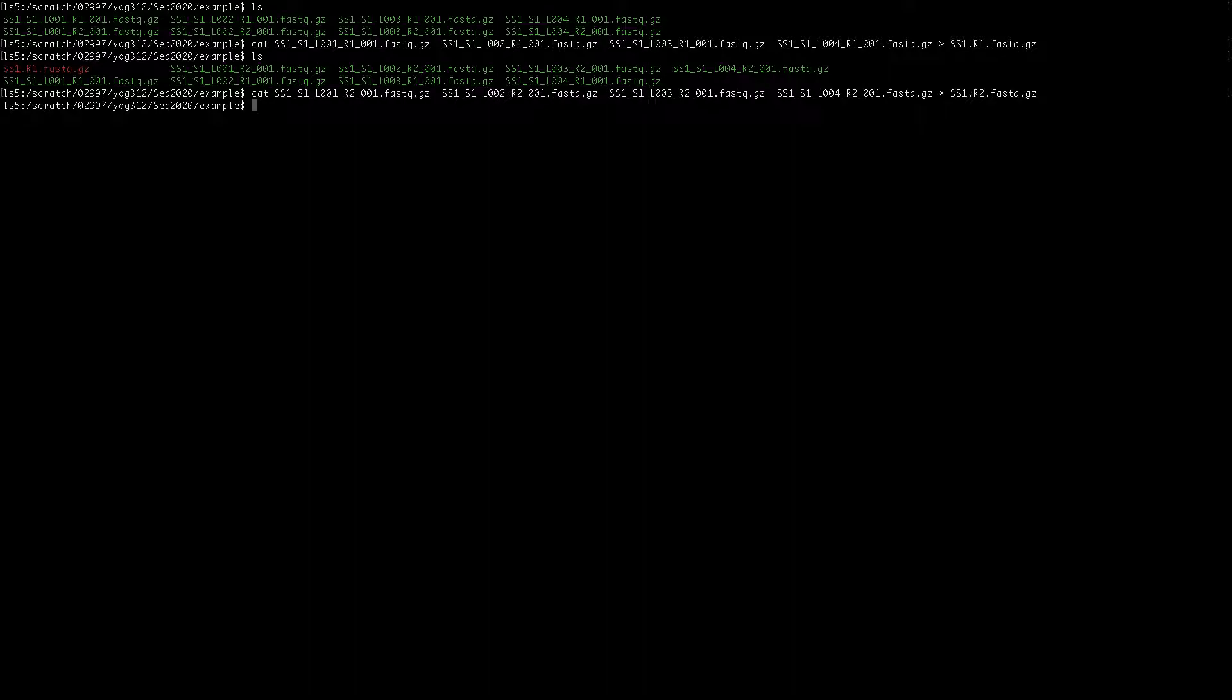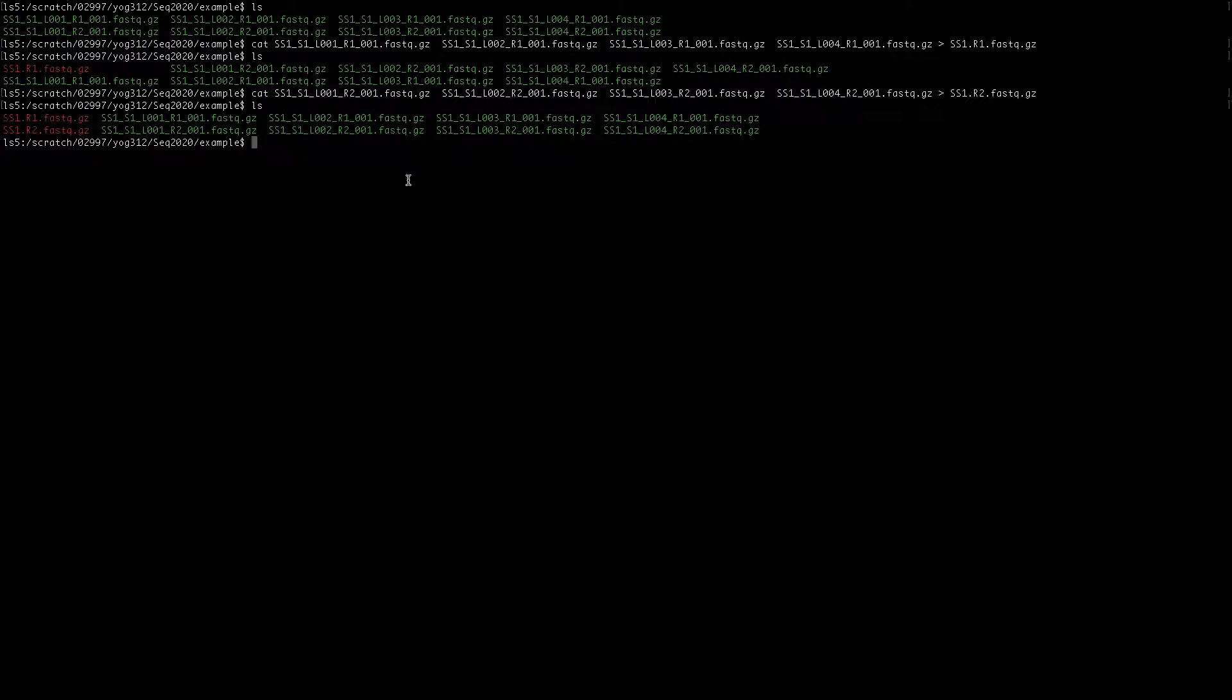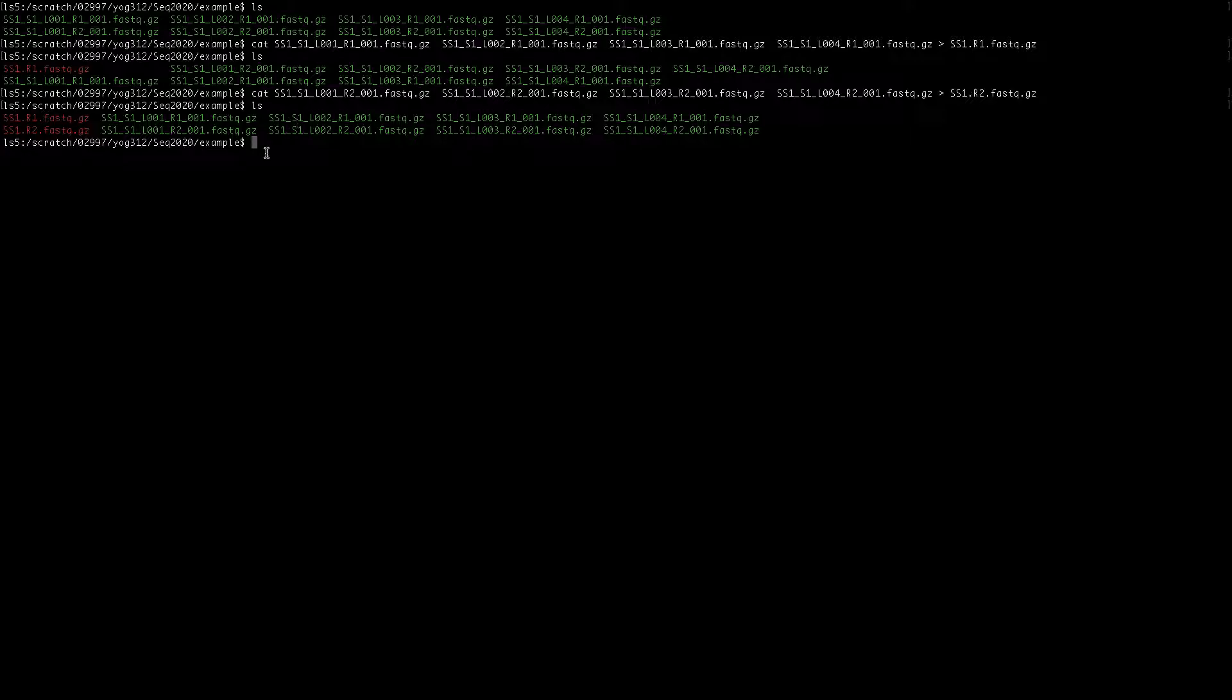Now you can see we have read 1 and read 2 FASTQ.gz files. We have combined all the individual files. Now if I want to unzip these zipped files - FASTQ files are commonly zipped as .gz - what I'll do is a simple command gunzip. If you want to unzip all of them, you can do star.gz.